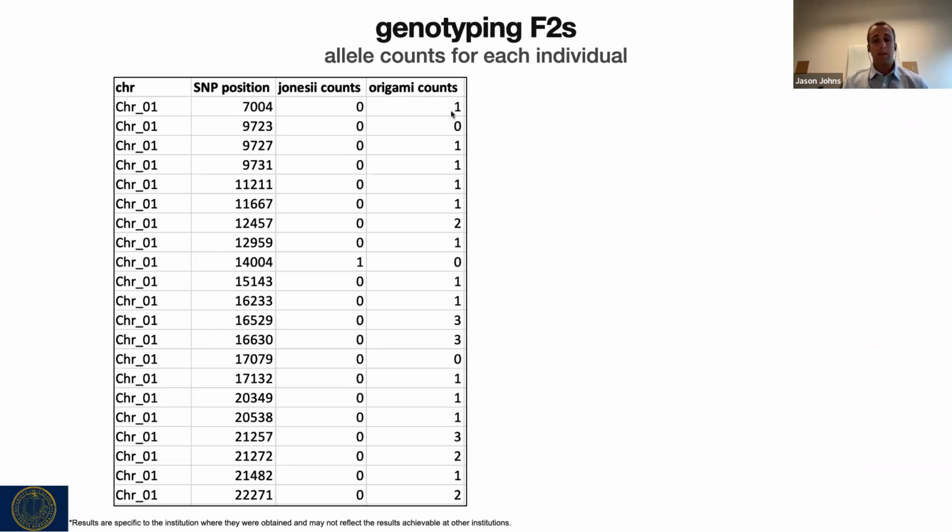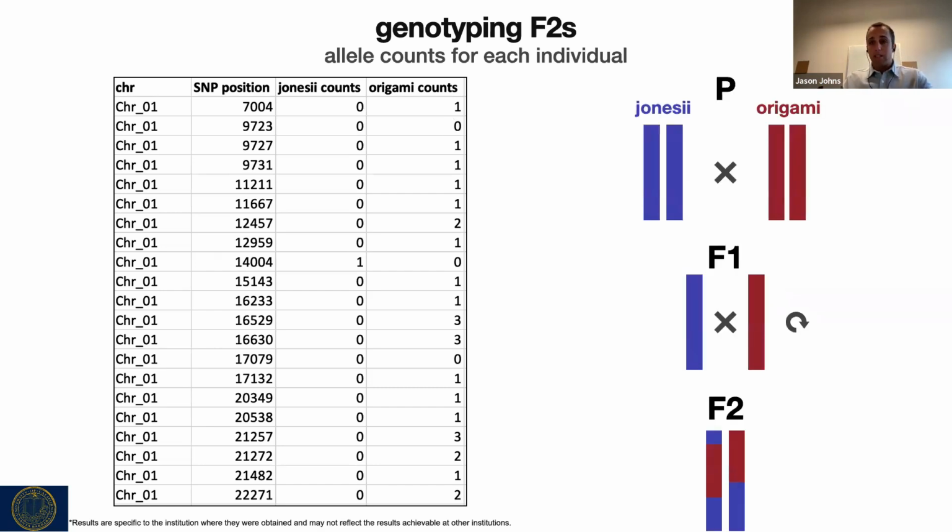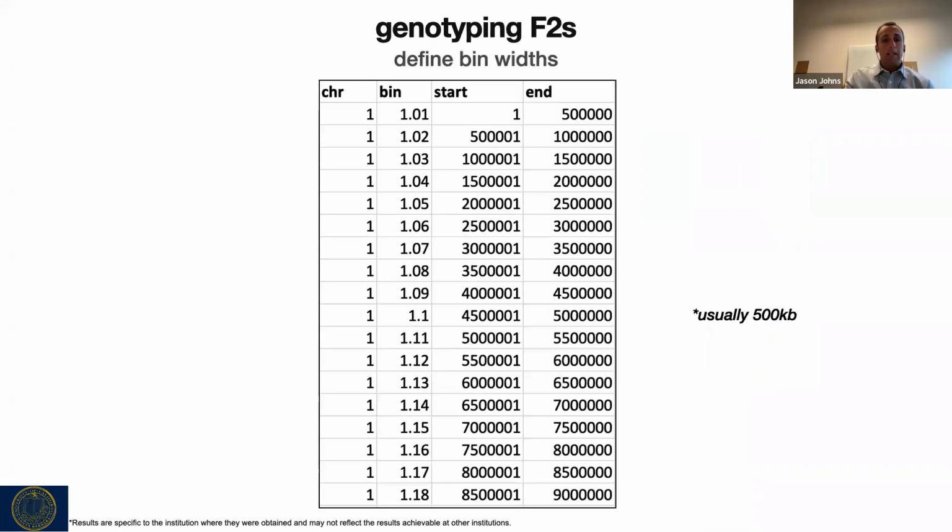So instead of genotyping at every SNP locus, we grouped these SNP loci into bins and genotyped the bins. We can do this because recombination only happens so often, only 1 to 3 times per chromosome per individual. By grouping into these big recombination bins, we can genotype the whole thing. For those bins, we typically used about 500 kb.